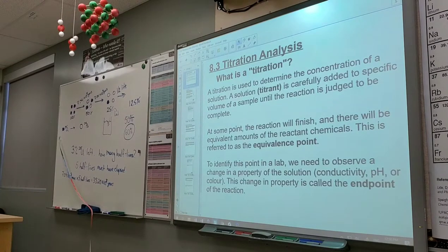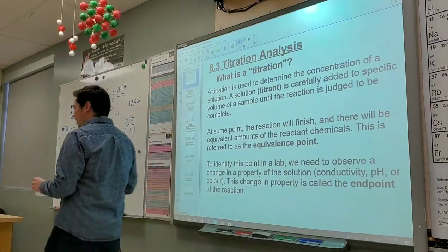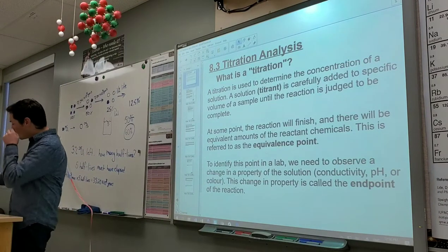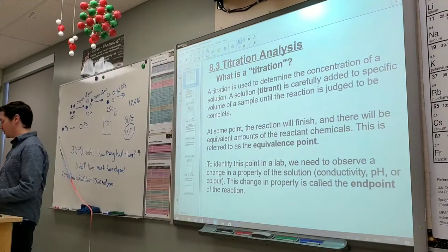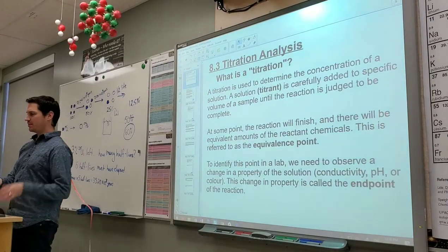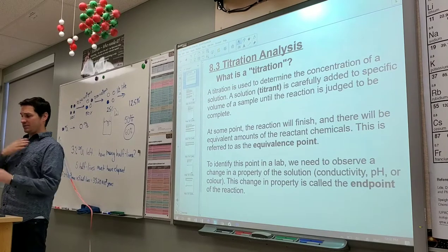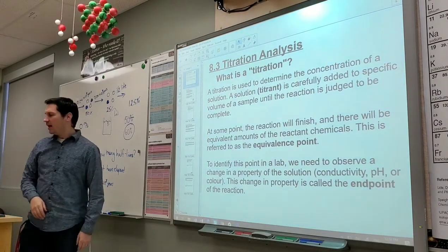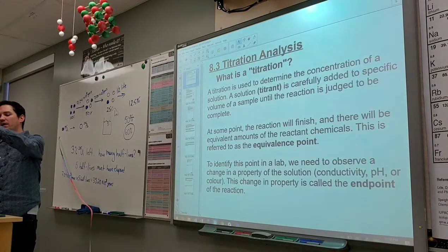Titrations are a very specific type of quantitative chemical analysis. When we do titrations, typically it's an acid and a base, but it doesn't have to be. We could do precipitation titrations, we could do redox titrations. We can do lots of different stuff. A titration is going to be using this piece of glassware.